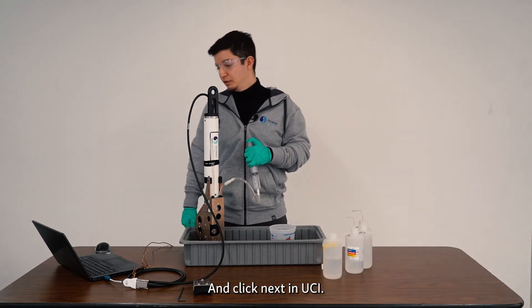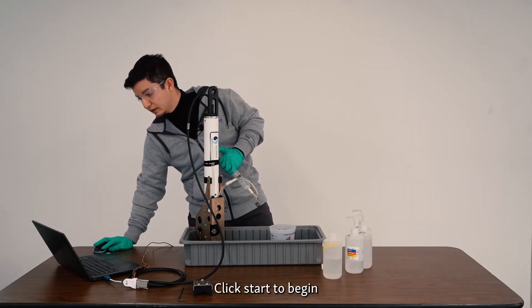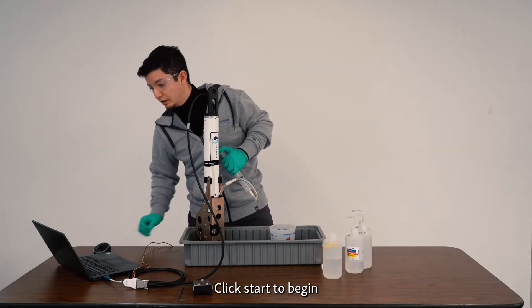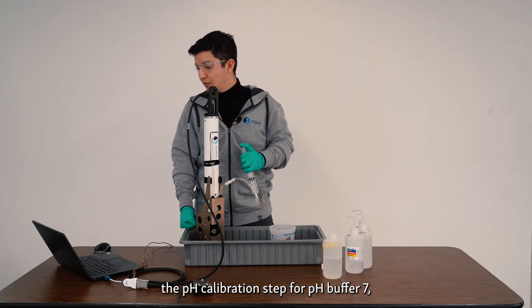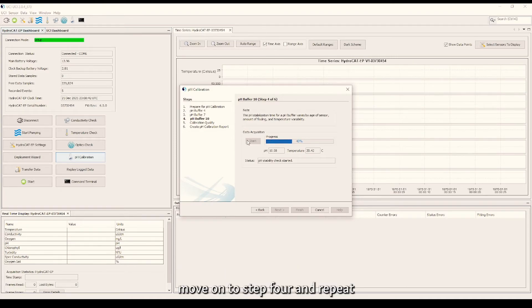Click next in UCI and hit start to begin the pH calibration step for pH buffer 7. After the completion of the pH buffer 7 step, move on to the next step and repeat this process with pH 10 buffer solution.